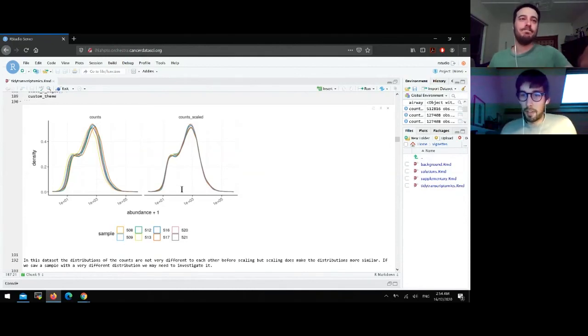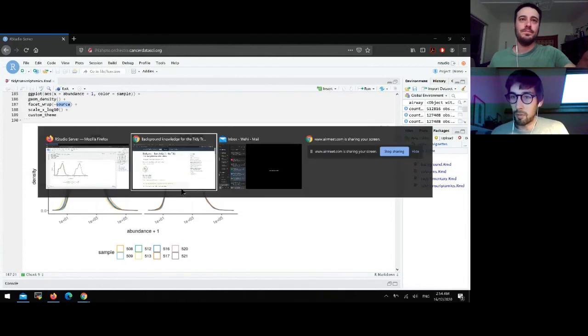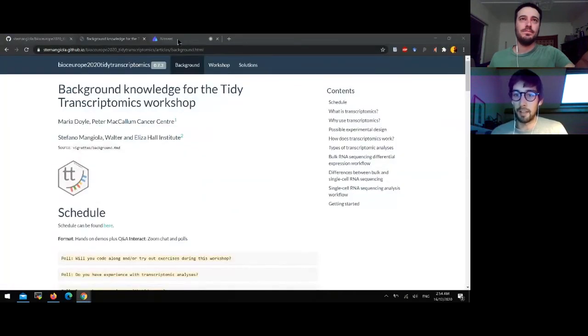I have a question here from Felix, who is asking if tidybulk is the central melt function of the data.